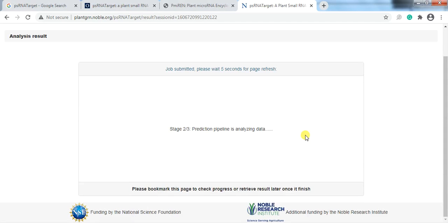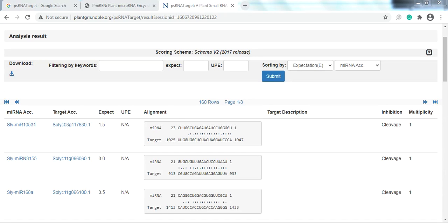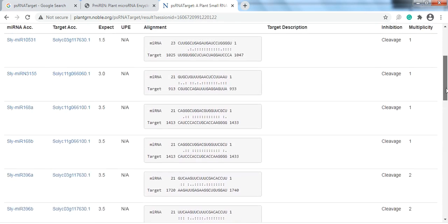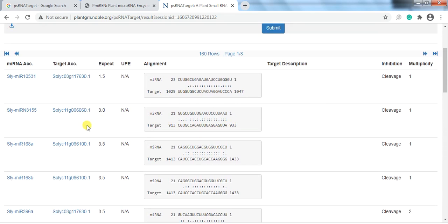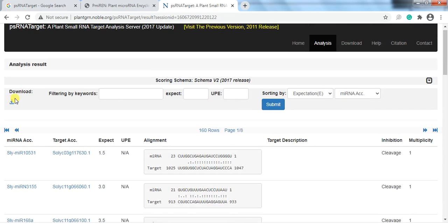It gives a warning that the job is running — we wait until it finishes. When the process is complete, you will see a table containing the name of the microRNA, the targeted gene, the microRNA sequence, and the alignment between the microRNA and the gene sequence. You can see many different microRNA sequences found in our genes. Click 'Click to Download' and save it.